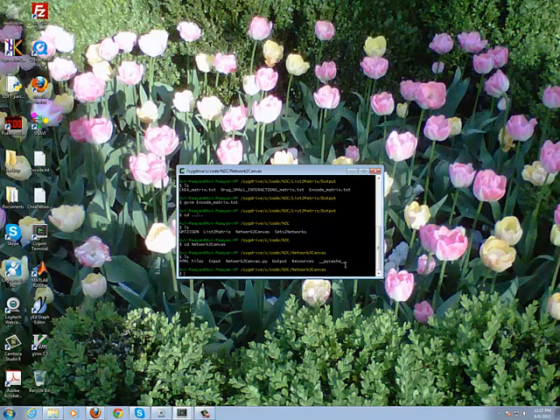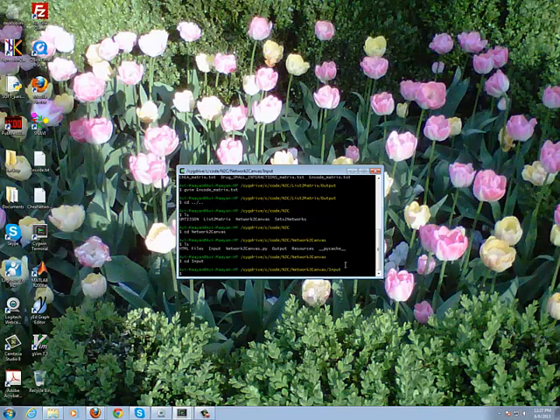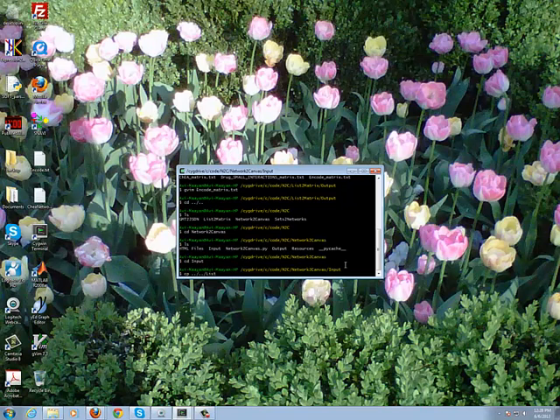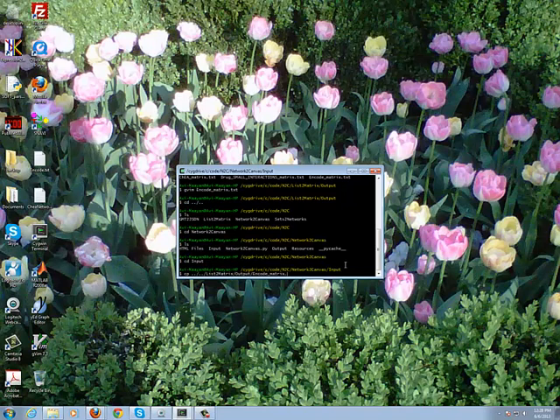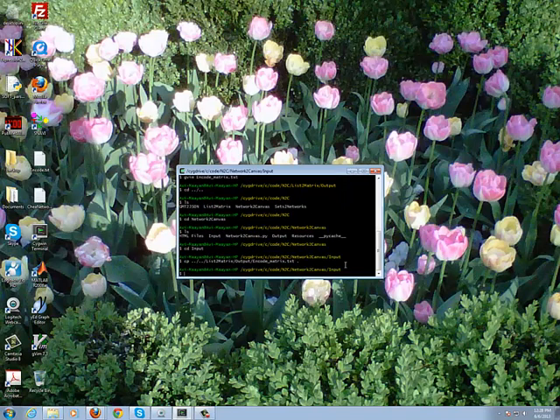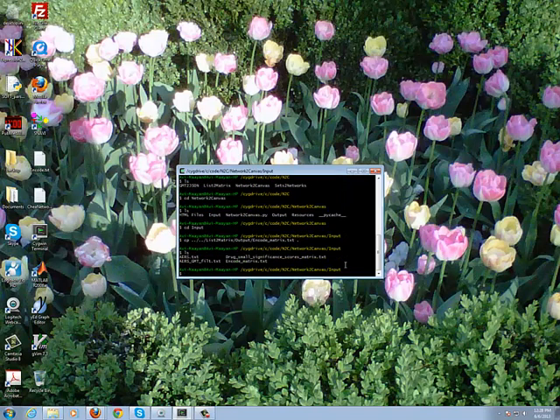For the input folder, we need to copy. So we're going to go to the input folder and then we're going to do a copy. List-to-matrix/output/encode_matrix.txt. We want it here.